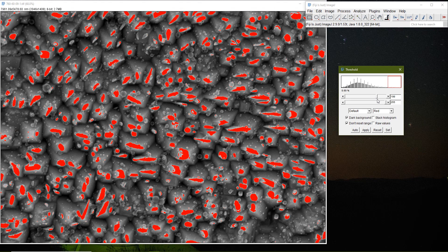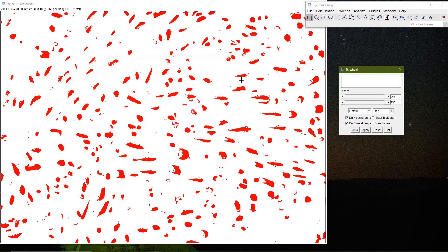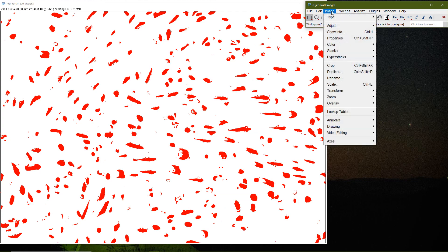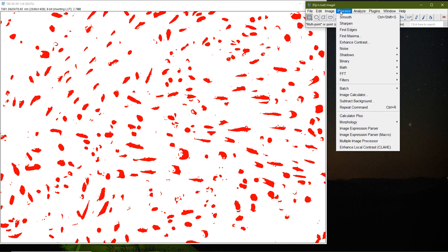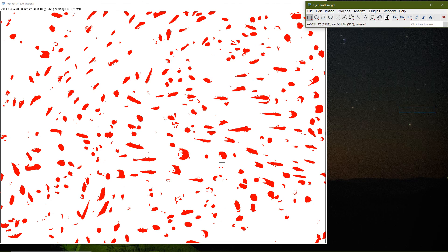I adjust the threshold to get a representative image of the particles, then select Apply. It says the background has been removed and the image is converted to binary — now the particles are separated. I then go to Process > Binary > Fill Holes, which fills in gaps inside the particles, giving me more complete particles.